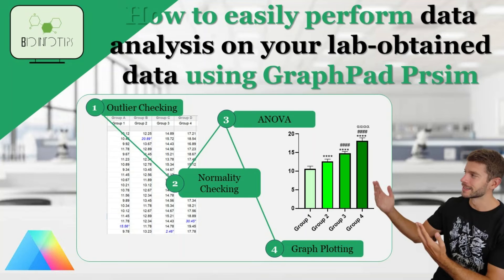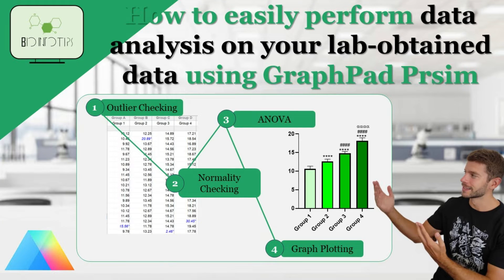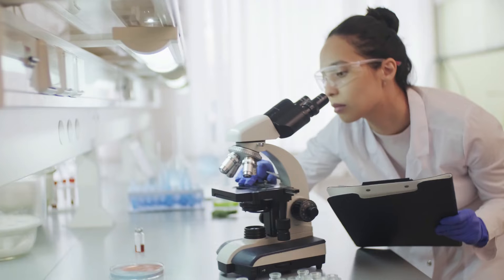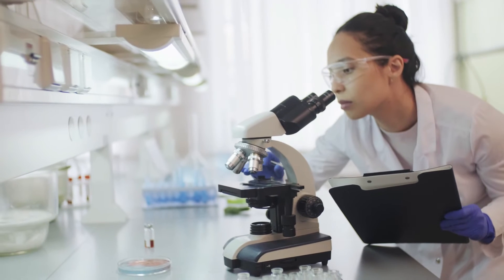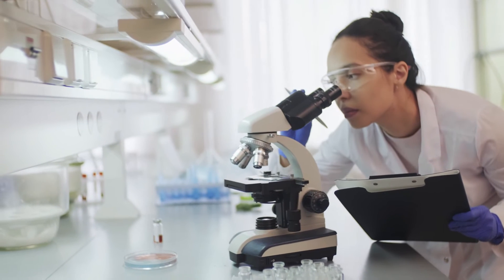Hey everyone, welcome back to BioInfo Tips. Today, we're learning how to perform the analysis of your lab-obtained data, from the data cleaning to the graph plotting.